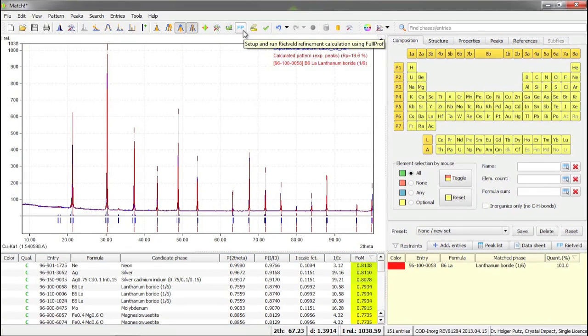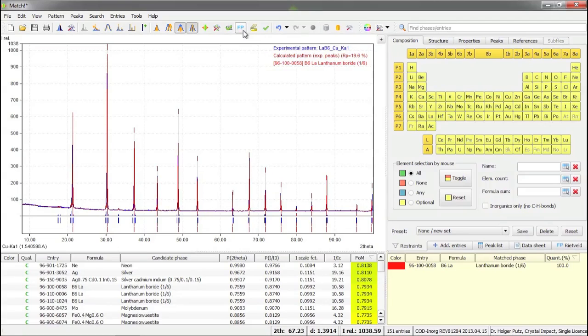FP is an abbreviation for full prof and should be regarded as a reminder that full prof will actually perform the calculations in the background later on.